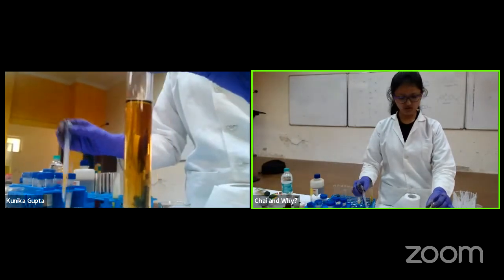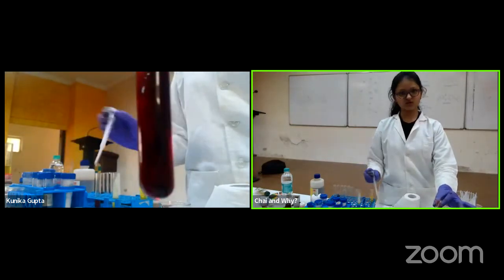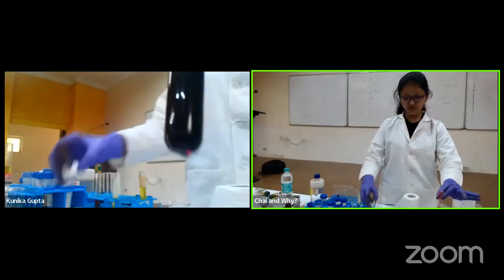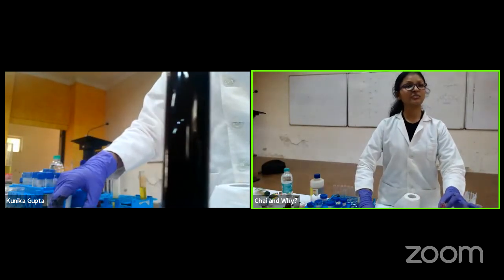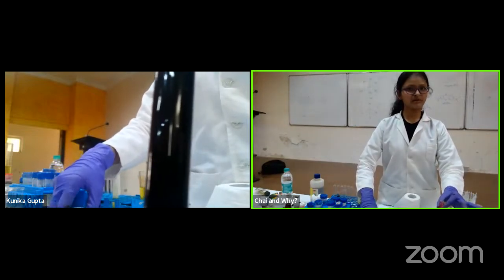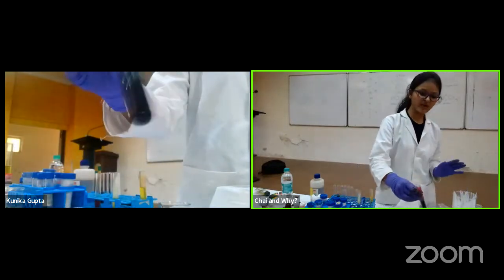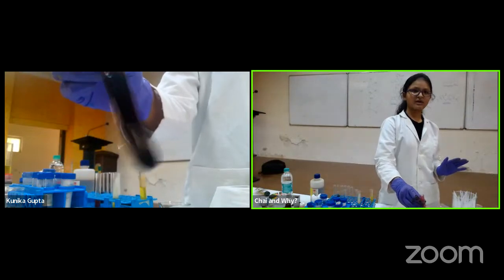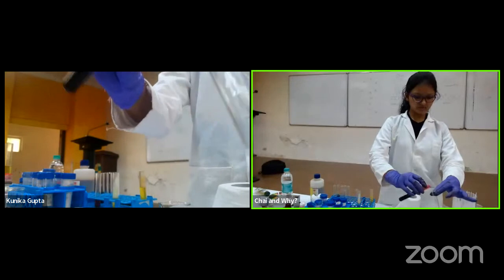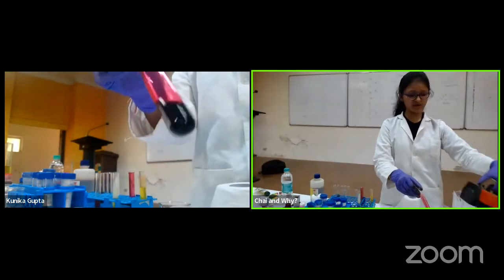You can see it. Yeah, I am seeing. You see a color change. So this is one part of the dye molecule which has been synthesized. So it's not that easy that it just formed, because I have just added a random amount to it, right? I put in anything. But yes, since two things are mixed together, they would have reacted. They have reacted. Okay. Now I'll take a dilute amount of it because it's too concentrated. I have just transferred it here. I'll show you under UV again.